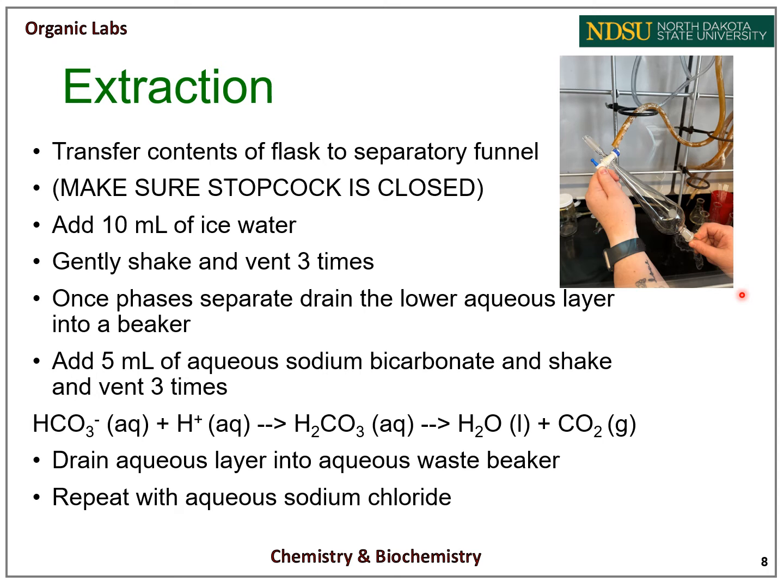Next, add 5 milliliters of aqueous sodium bicarbonate. This is to remove any excess acid that is still present and neutralize the solution. It follows the chemical reaction seen here.